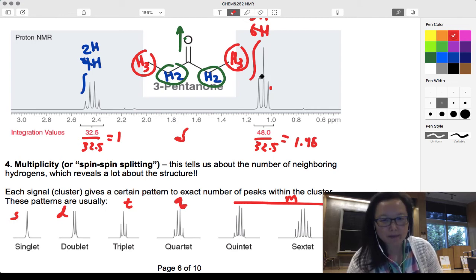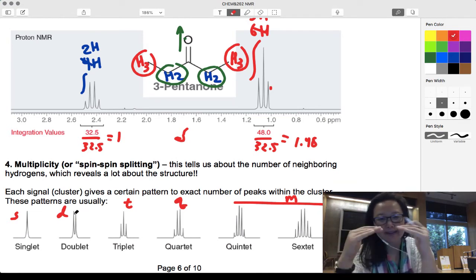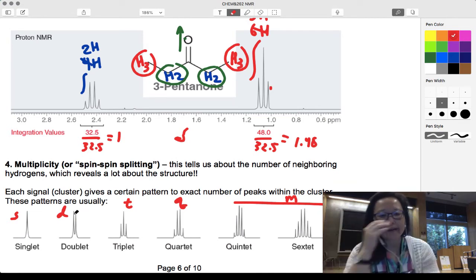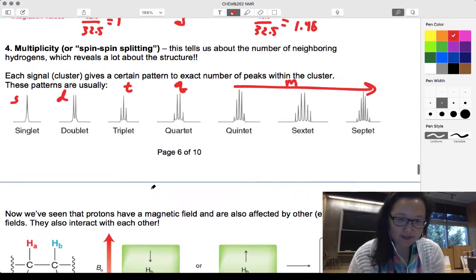Now, they're not going to be perfectly aligned. Like this and this are not always exactly the same. The doublet is not exactly the same, and one might be slightly higher. So don't worry too much about that, but just know approximately the shape, the profile of these curves.